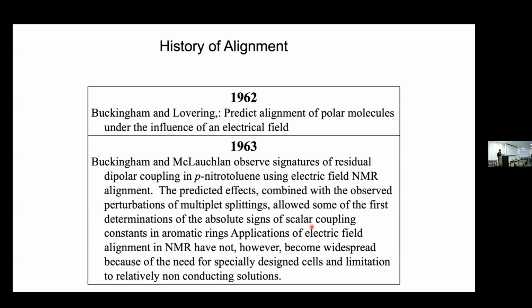So I'm going to quickly go through some history, just because I find this super fascinating. That's the first thing I did as a grad student, by the way, write the history of alignment. This is a long-standing effort in the NMR community. This is not new. It started in the 60s.